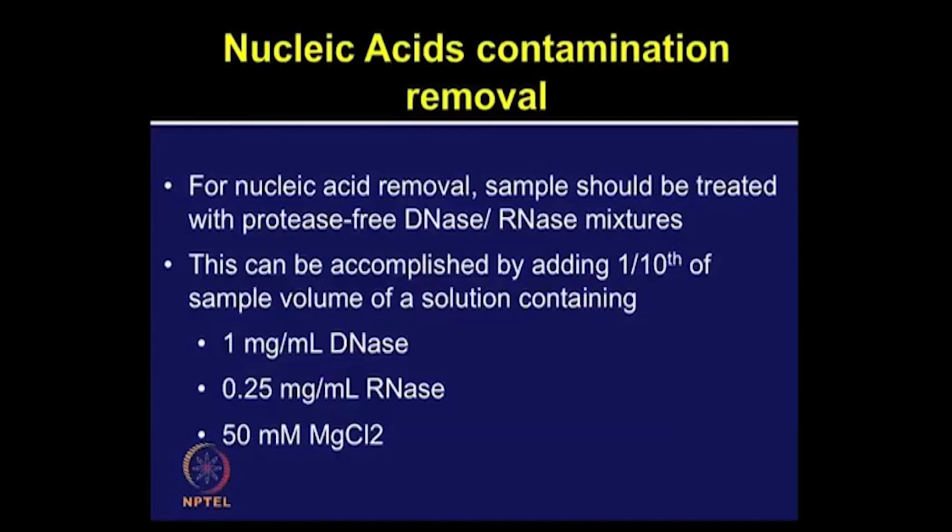Please perform these steps in cold conditions. Try to keep this reaction in ice, so that you are effectively performing the nucleic acid contamination removal.